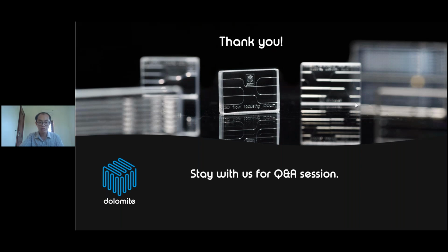Okay, so I got another question from Kajars. What's the cost of this instrument if we buy in India? Actually, the cost of this instrument depends on what type of instrument you are interested in. For example, a single channel system or an ANPS system, automated nanoparticle system.